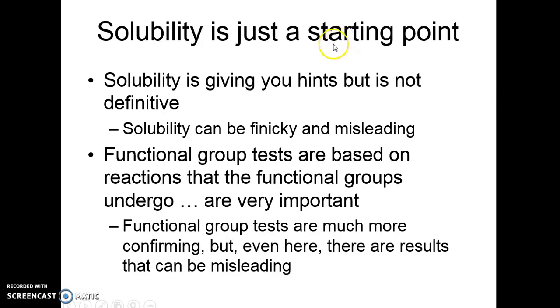This is just a starting point. It gives you hints as to what the functional groups can be. But remember, every single test you run has to be taken with a grain of salt. The solubility test can be finicky and misleading, and the functional group tests can be finicky and misleading too. So you look at everything as a picture and you try to interpret it together.